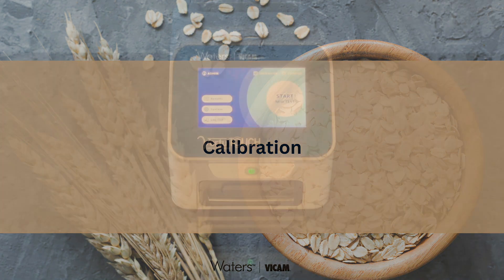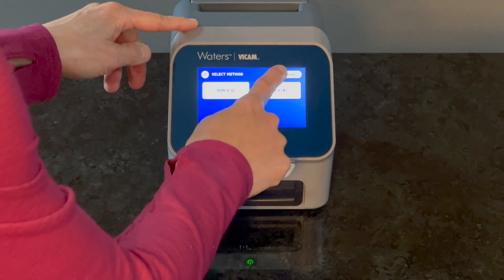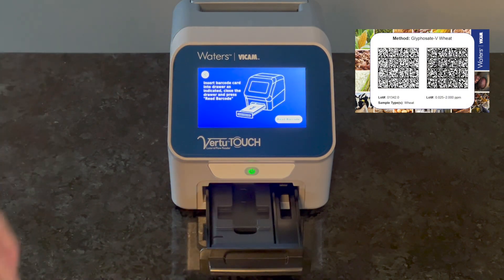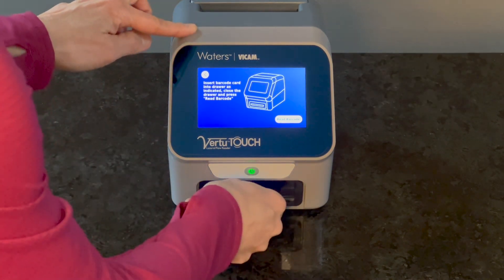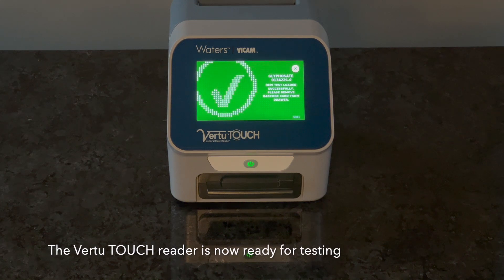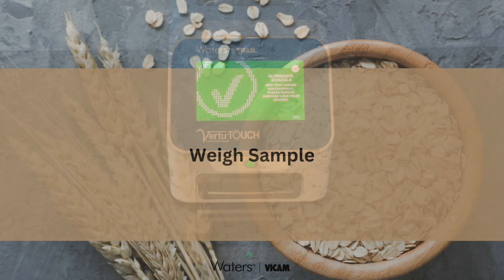Start by calibrating the VirtuTouch reader using the barcode supplied with the Glyphosate V kit. For this method, we'll enter barcode A for wheat sample analysis. Oats and other sample types may utilize a unique barcode, which is specified in the instruction poster provided for each kit. Once the calibration barcode is scanned, the VirtuTouch reader is ready for sample analysis.